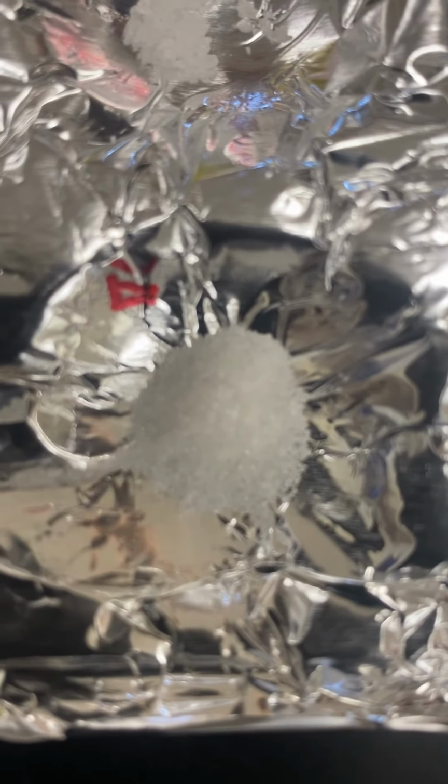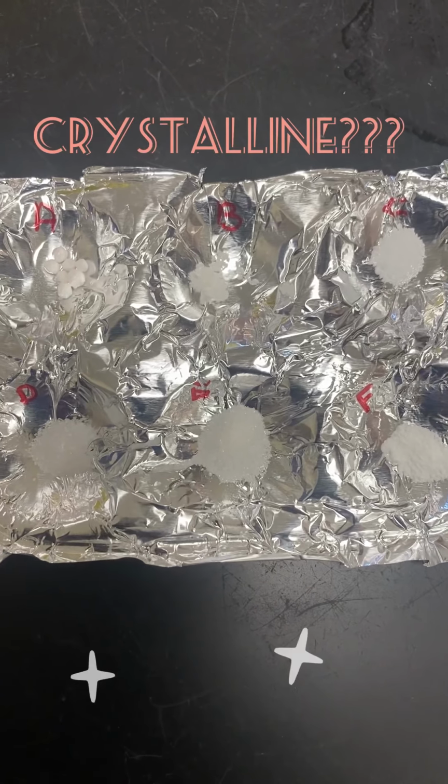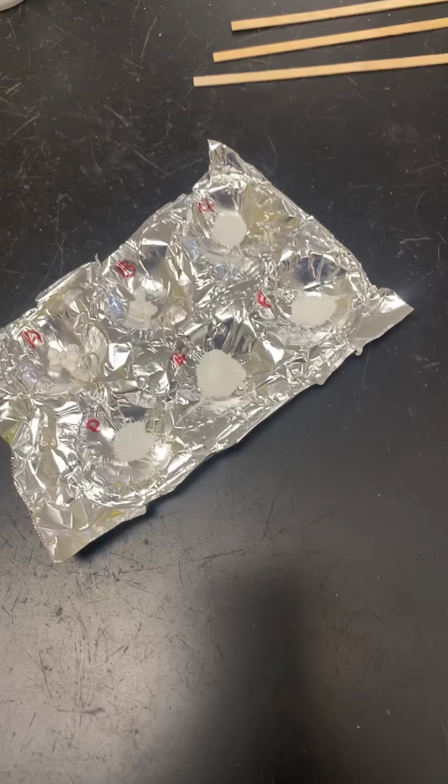Sample E. Sugar. Sucrose, also known as sugar. And then sample F. Tylenol or acetaminophen. Looks like the powdery one there. Okay, so you basically want to say, are they crystals or not?